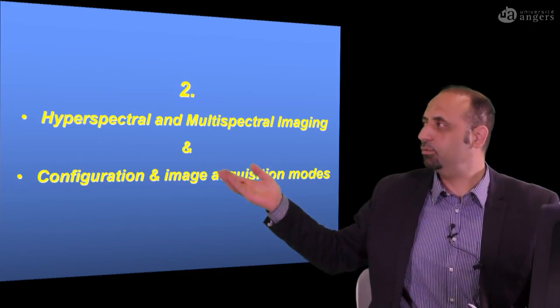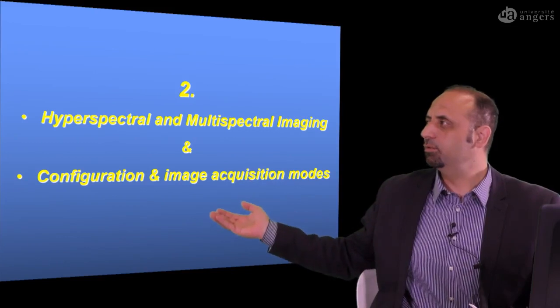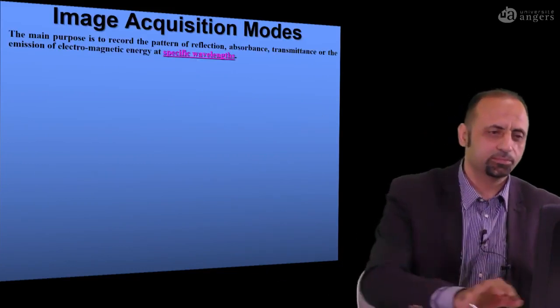In this session, we are going to speak about hyperspectral imaging and multispectral imaging, and then we will see different configurations, the image acquisition mode of both systems.